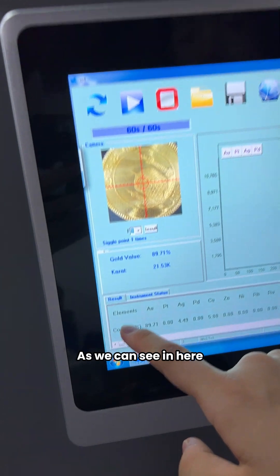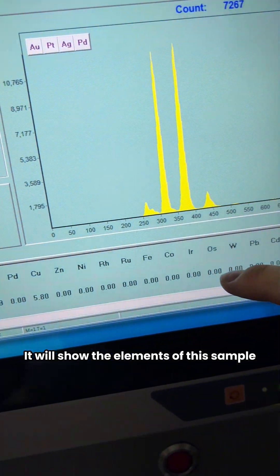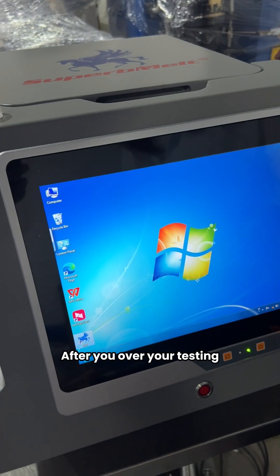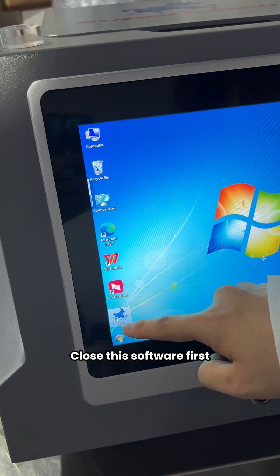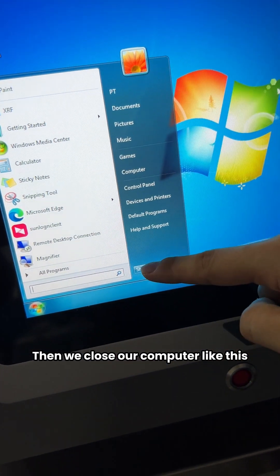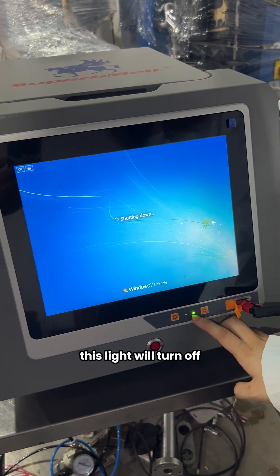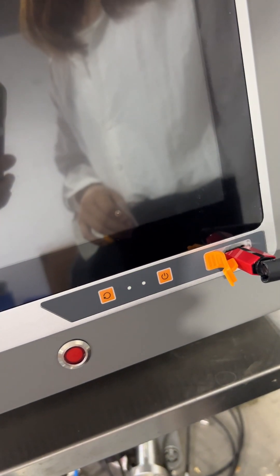It will show the elements of this sample and their content. After the testing is complete, close the software first, just like closing a computer. Then turn off the machine — this light will turn off, indicating the machine is shut down.